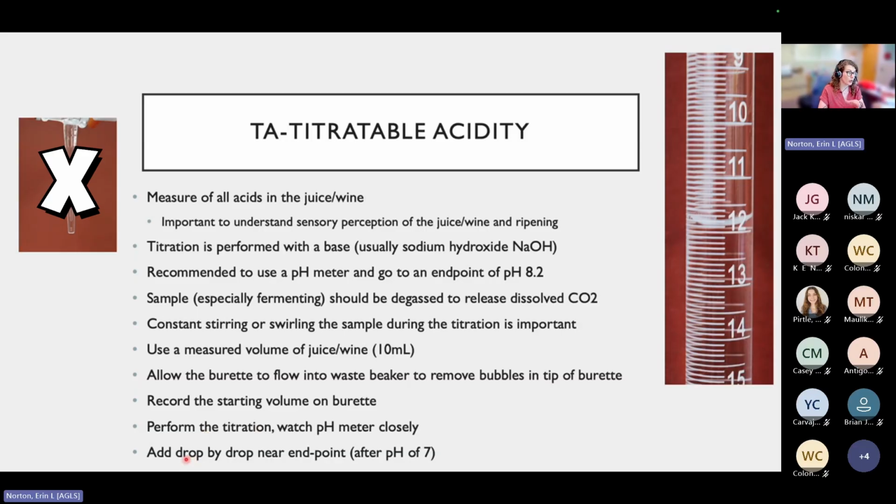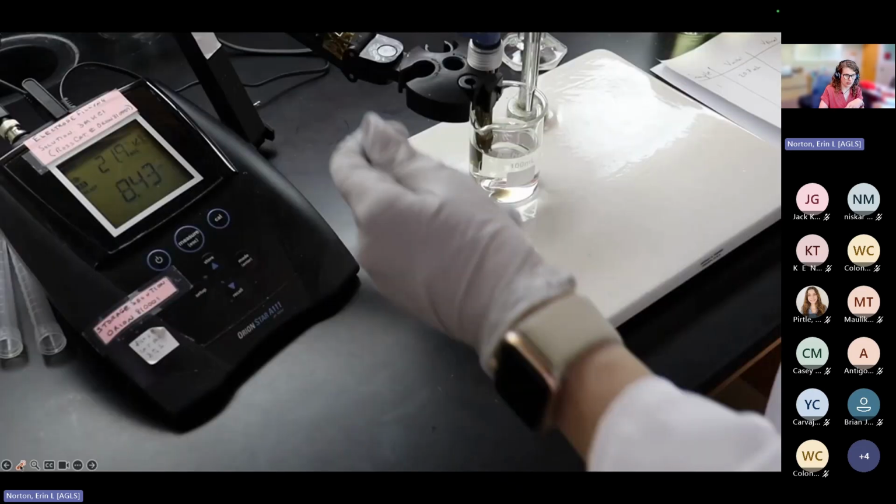And when you get close to the endpoint, you really do need to go drop by drop or you'll overshoot very quickly. When you're close, just a small drop of sodium hydroxide is going to push that pH far. So you can see that with this video.